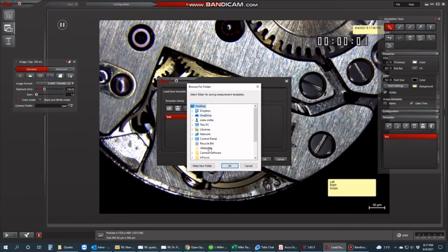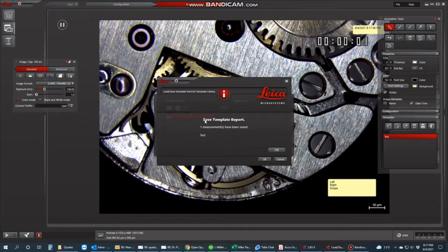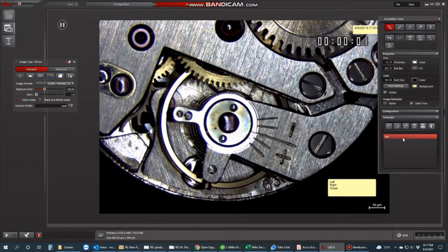And here you can see that this is saving it to my computer. I simply suggest you go to the same microscope images folder that you were at before, and you save your template. Clearly it's showing you saved here. Now we hit OK, and now our template's saved. Let's say we are happy with this image. Maybe we want to add some more text.